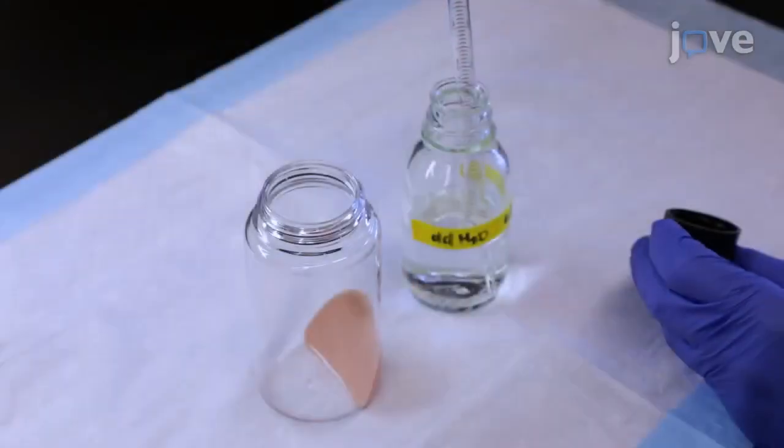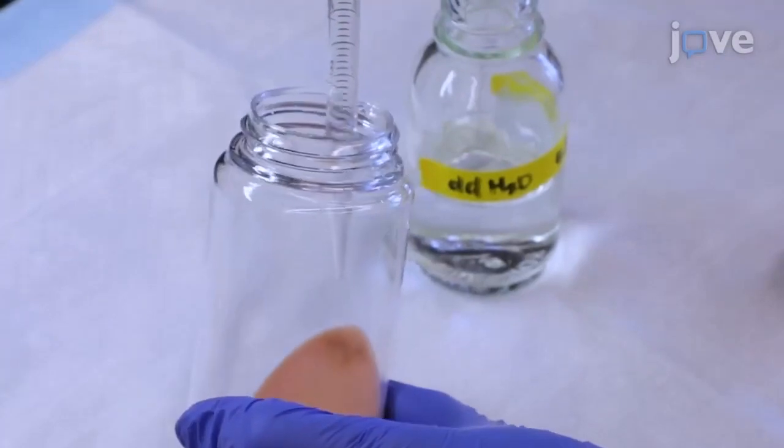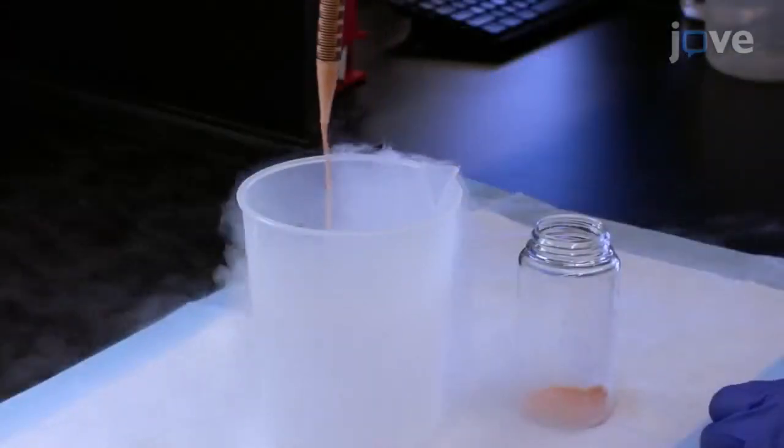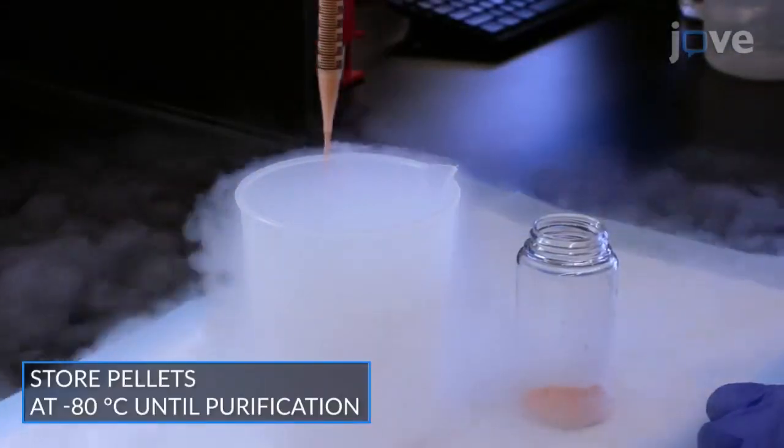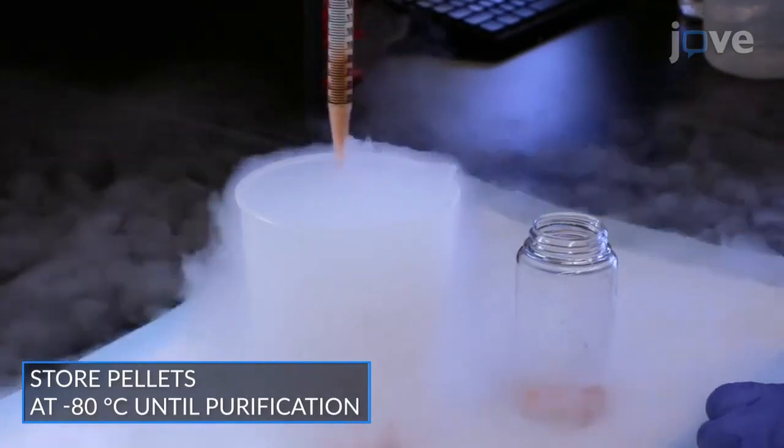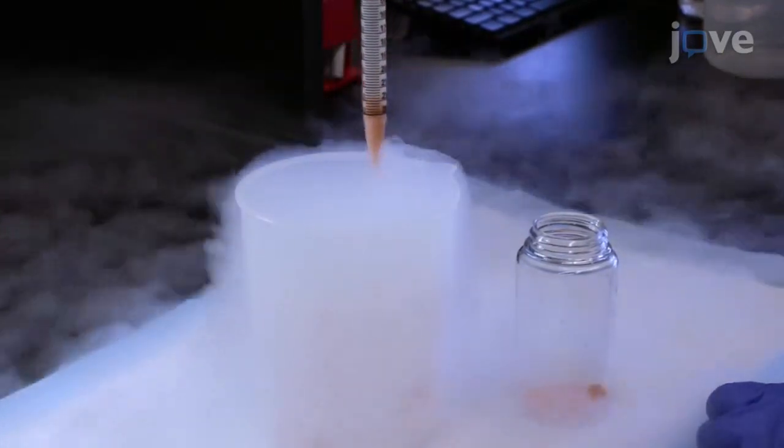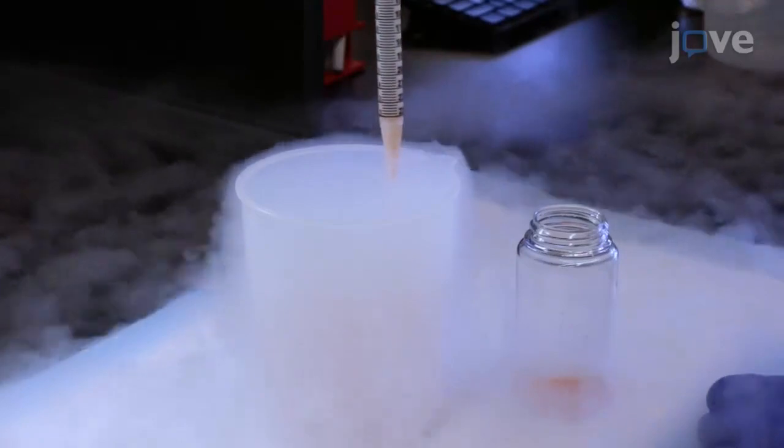Spin the cells again for collection and resuspend the pellet in about 2 milliliters of double distilled water. Then use a 10 milliliter pipette to slowly dispense the cell slurry into liquid nitrogen, one drop at a time, to produce frozen yeast cell pellets.